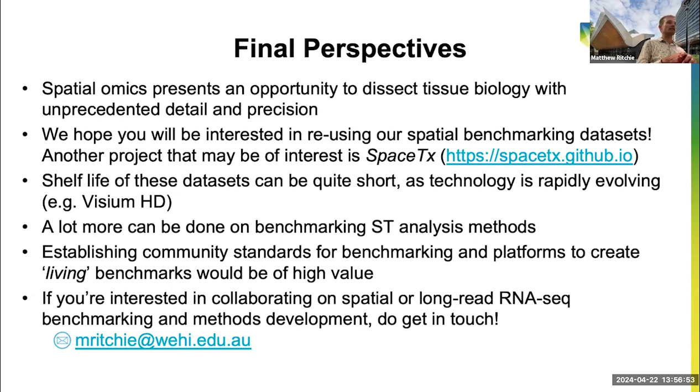And there's definitely, I think, a need for having more living benchmarks where, rather than you do your analysis and publish your paper, is it possible to make the data available and shareable and the analysis recomputable, so that as new versions of people's software come out, you can again check that they perform as they did before, or maybe ideally they perform better than they did previously. Definitely reach out if you're interested in collaborating on any of this, or you can just download the data yourself. So feel free to do that.